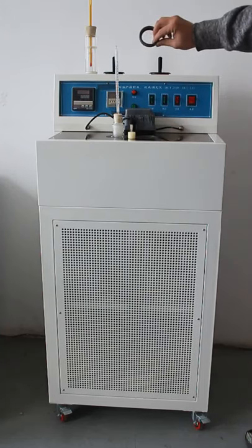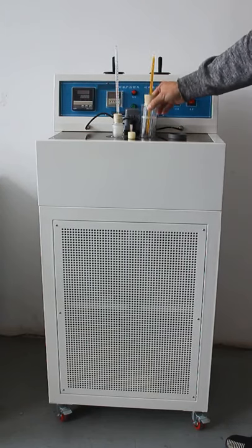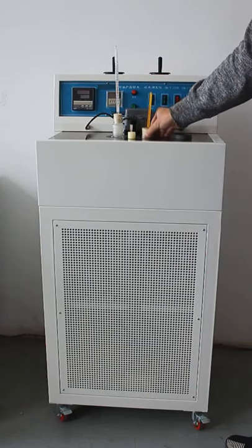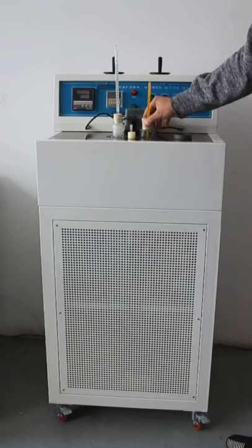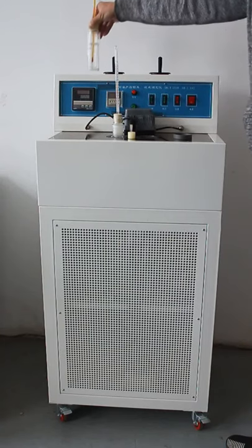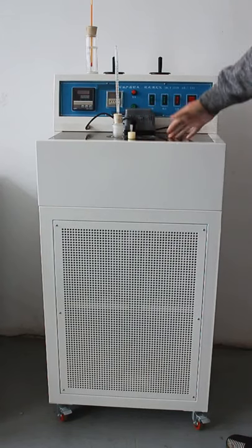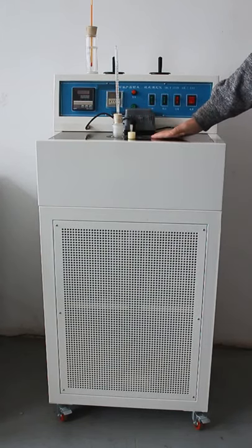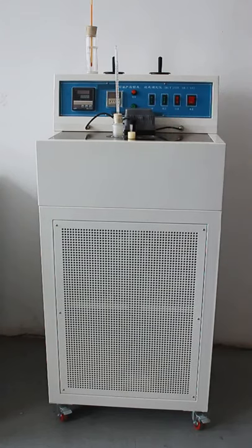To fit in the Pour Point test tube, remove the plastic cover. And you can place this into the cooling box like this. Now we have injected 95% ethanol. We are ready for testing.